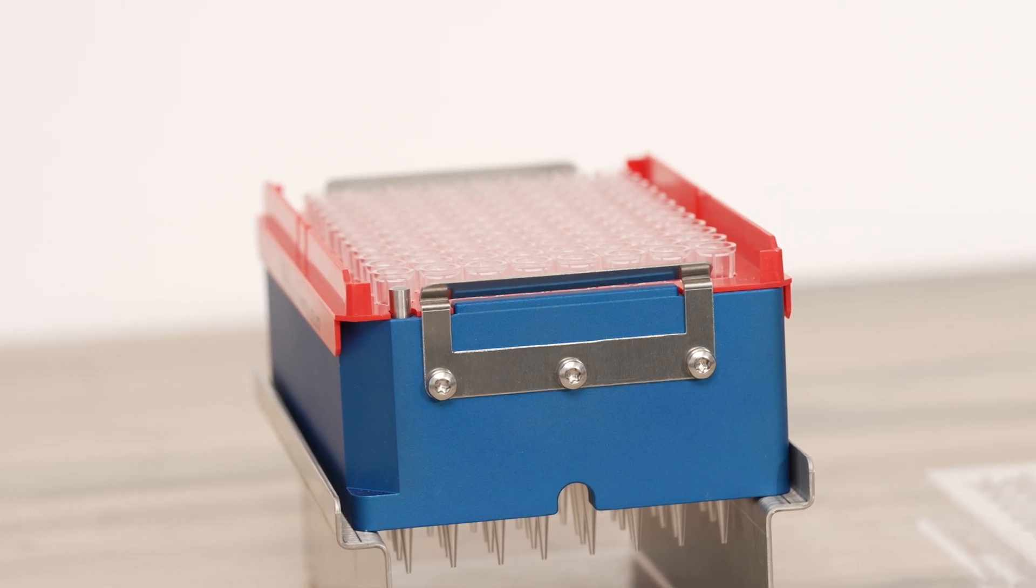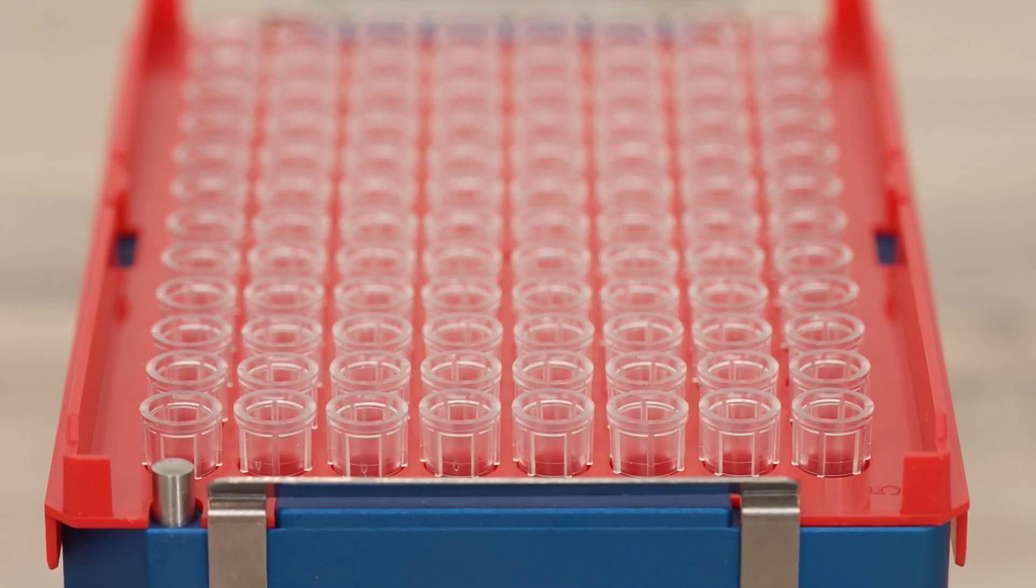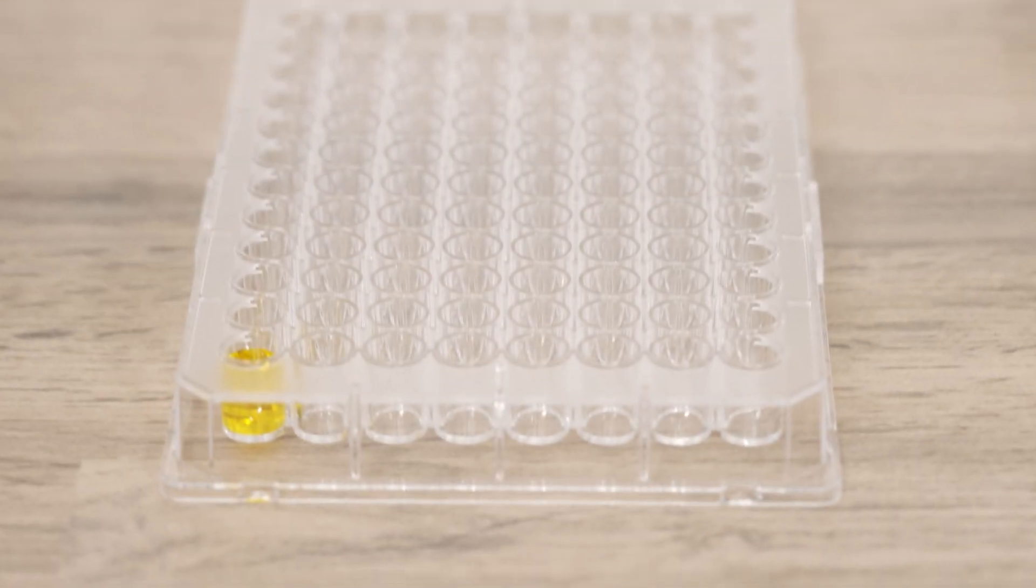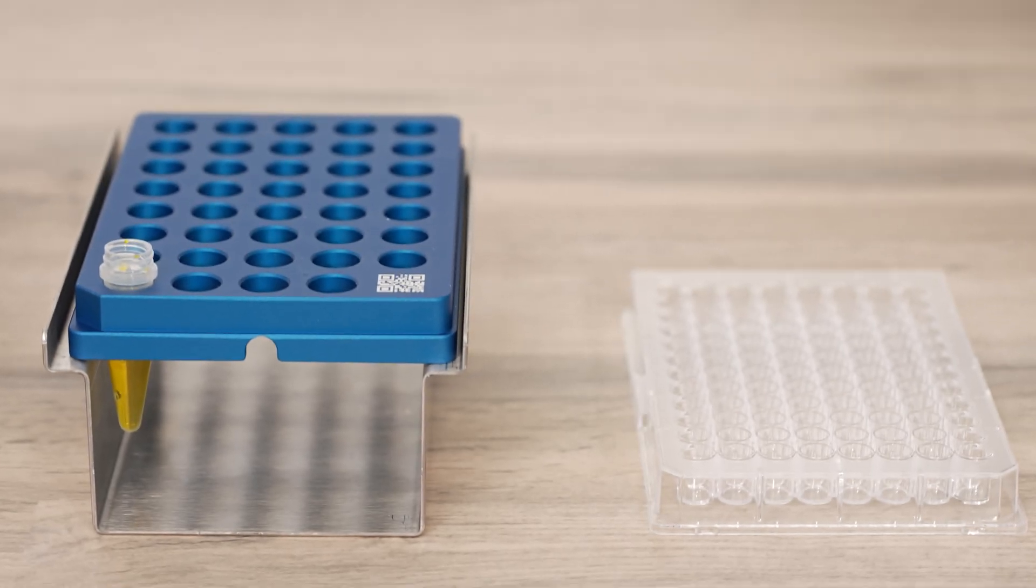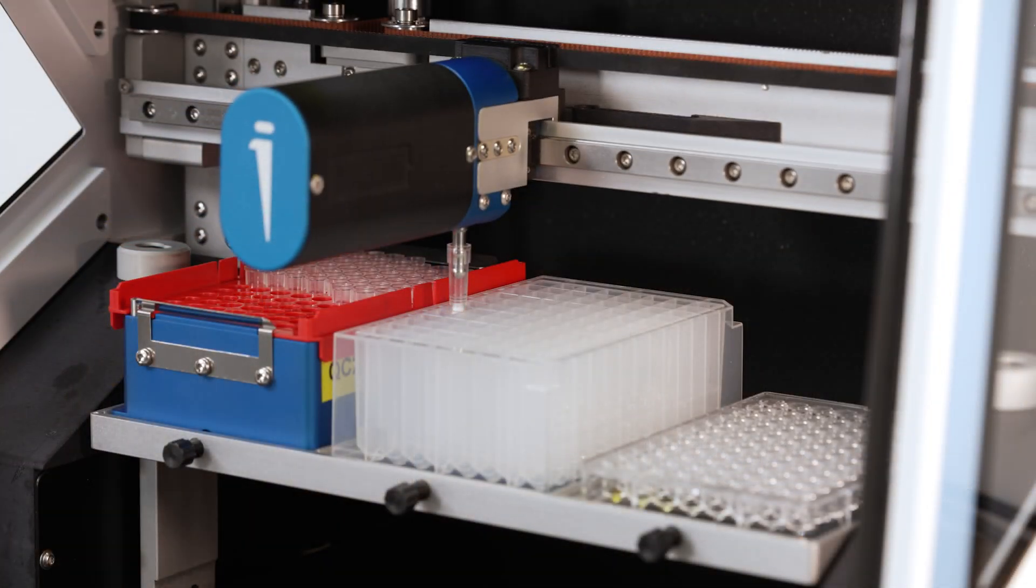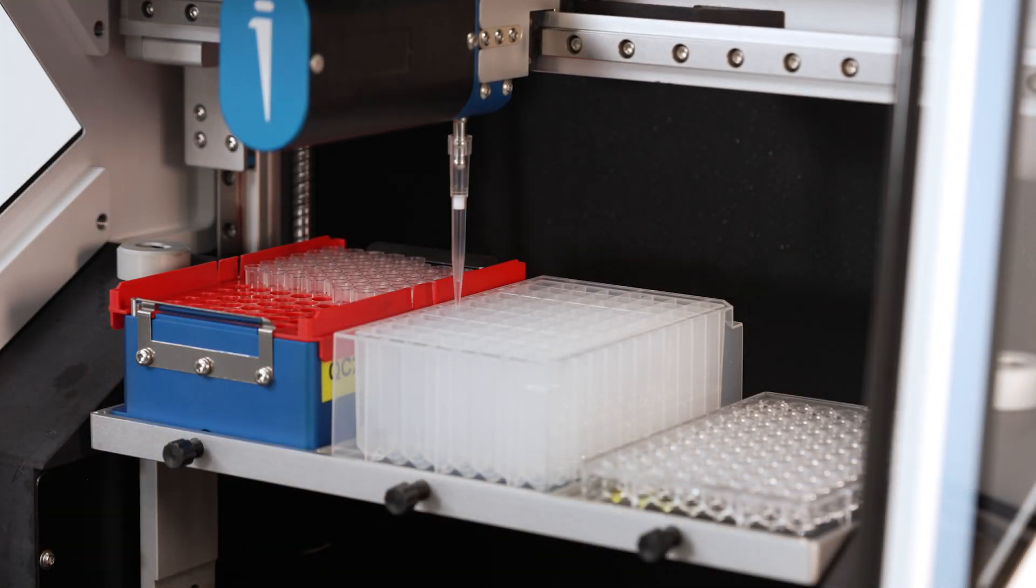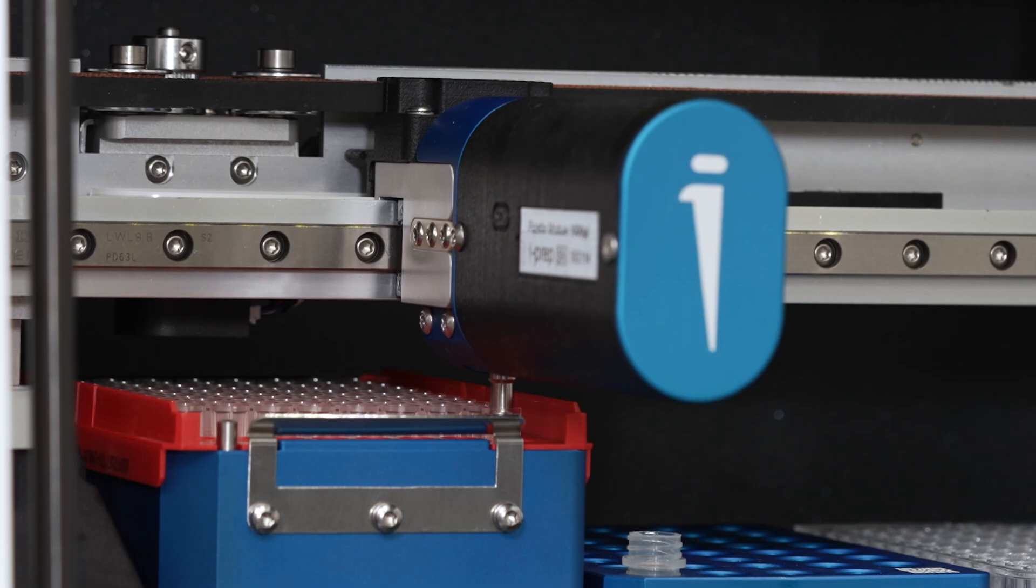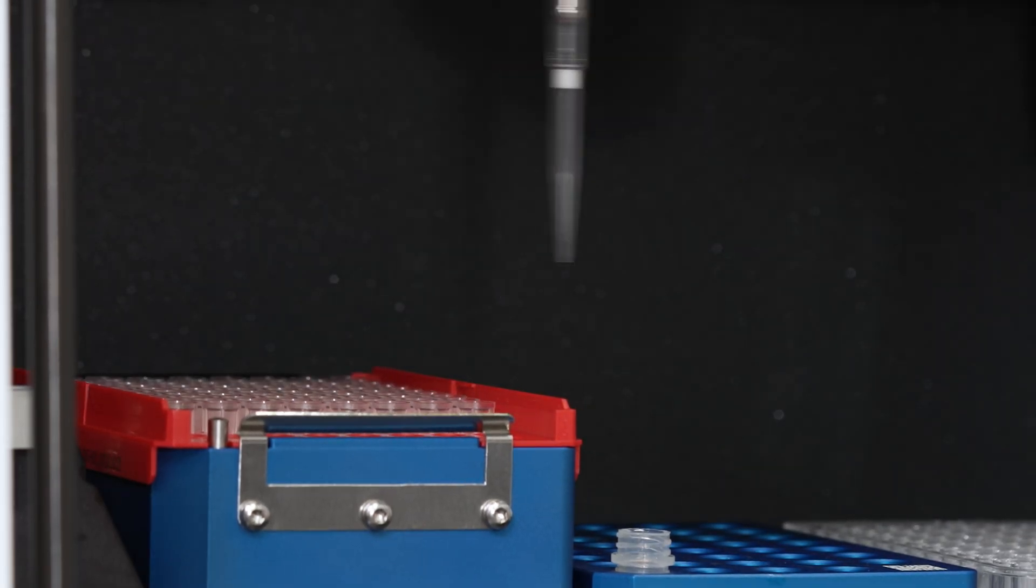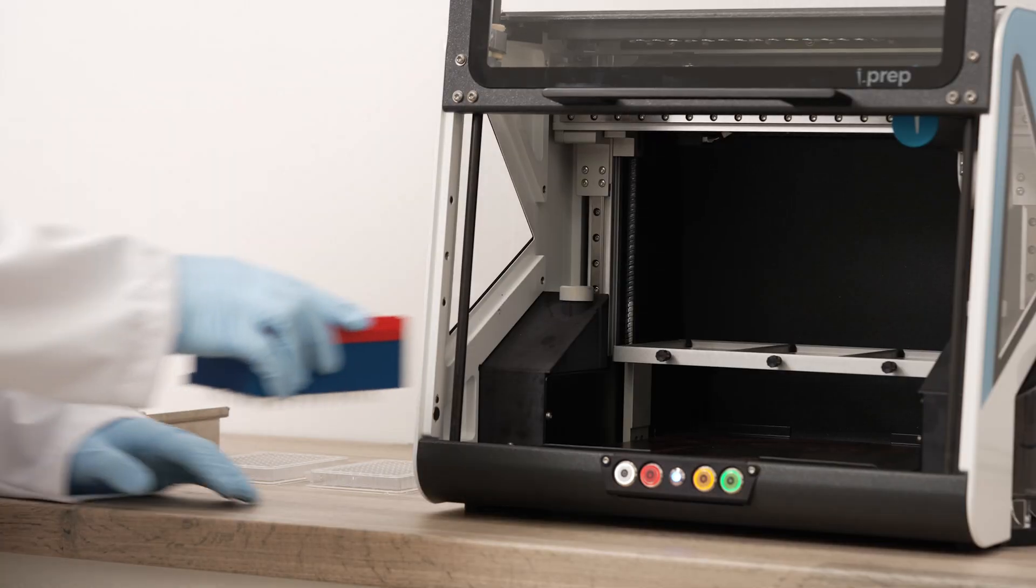iPrep can be used with a wide range of labware including microplates up to 384-well in density. Other options include tubes, deep well plates, and custom plate objects. iPrep also supports a range of pipette tips with different volumes as best suited to your application.